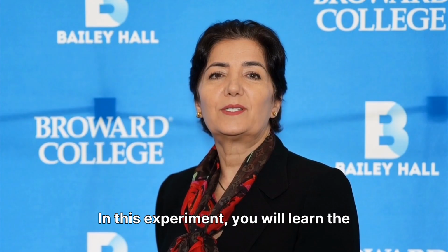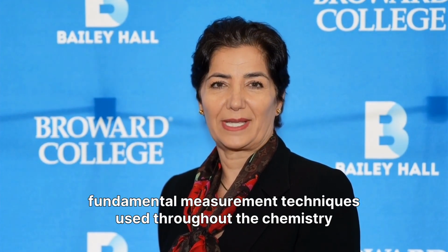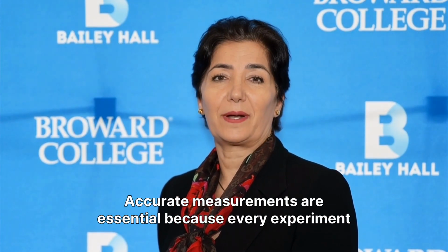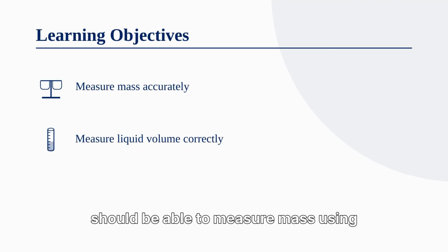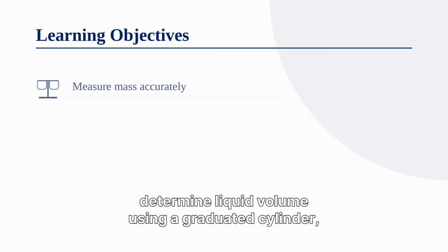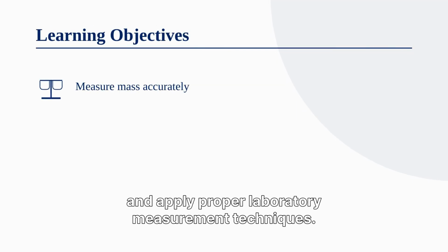In this experiment, you will learn the fundamental measurement techniques used throughout the chemistry laboratory. Accurate measurements are essential because every experiment depends on collecting reliable data. By the end of this experiment, you should be able to measure mass using an analytical balance, determine liquid volume using a graduated cylinder, and apply proper laboratory measurement techniques.